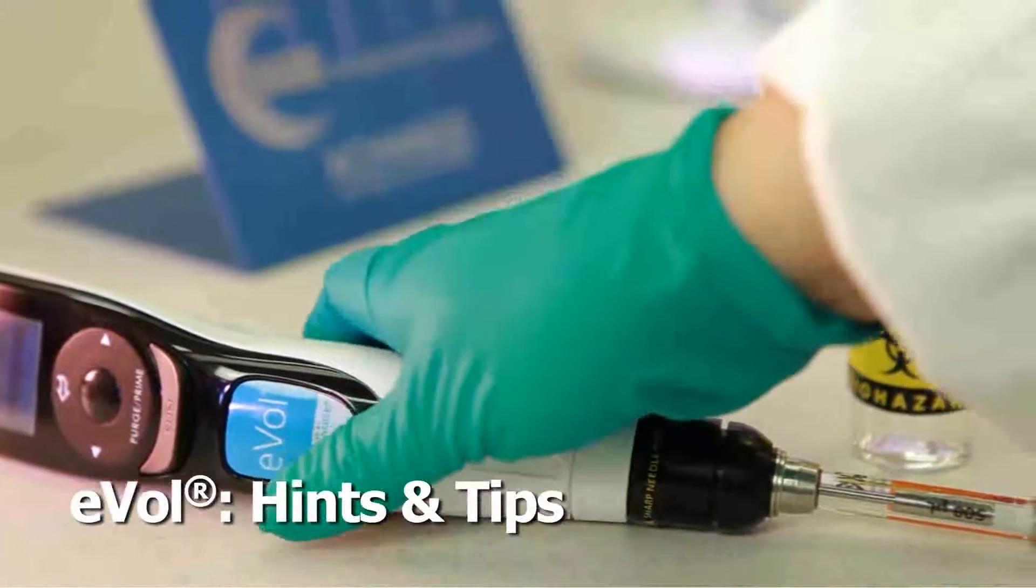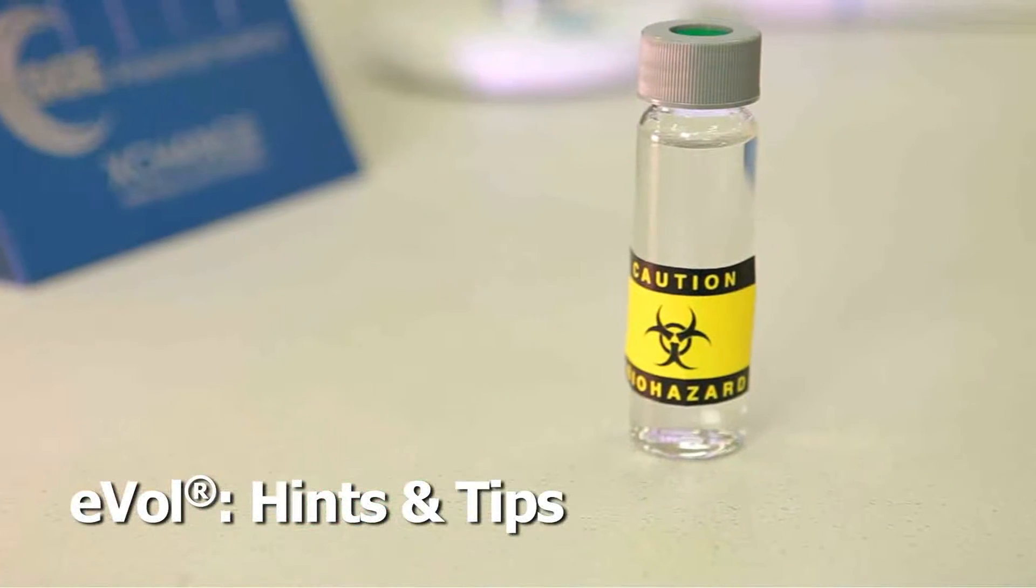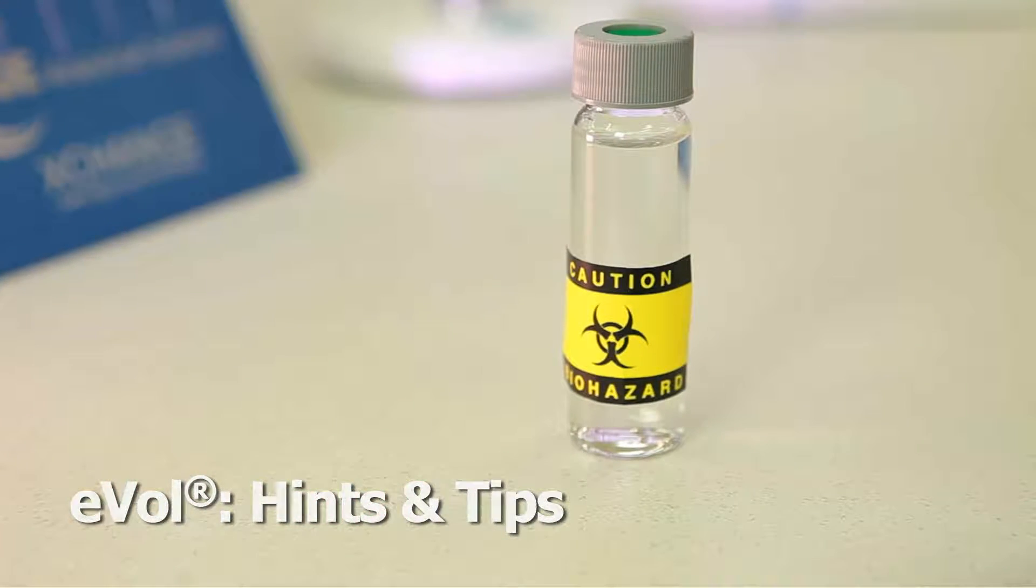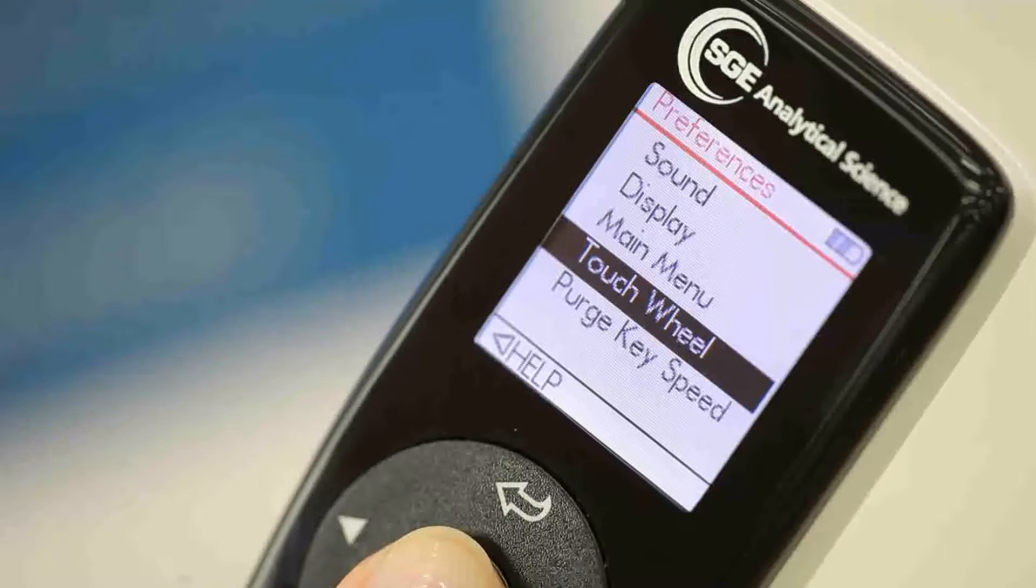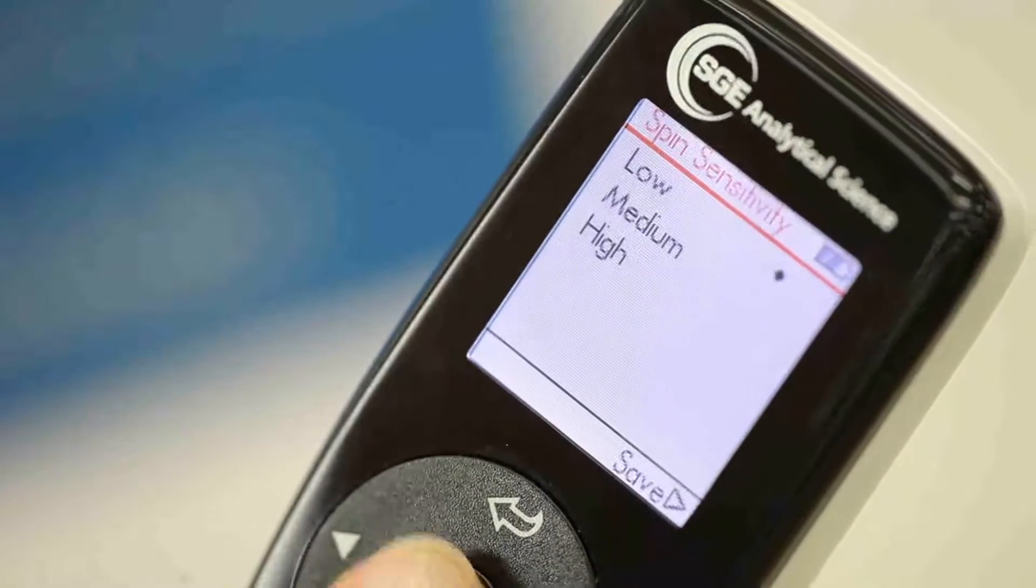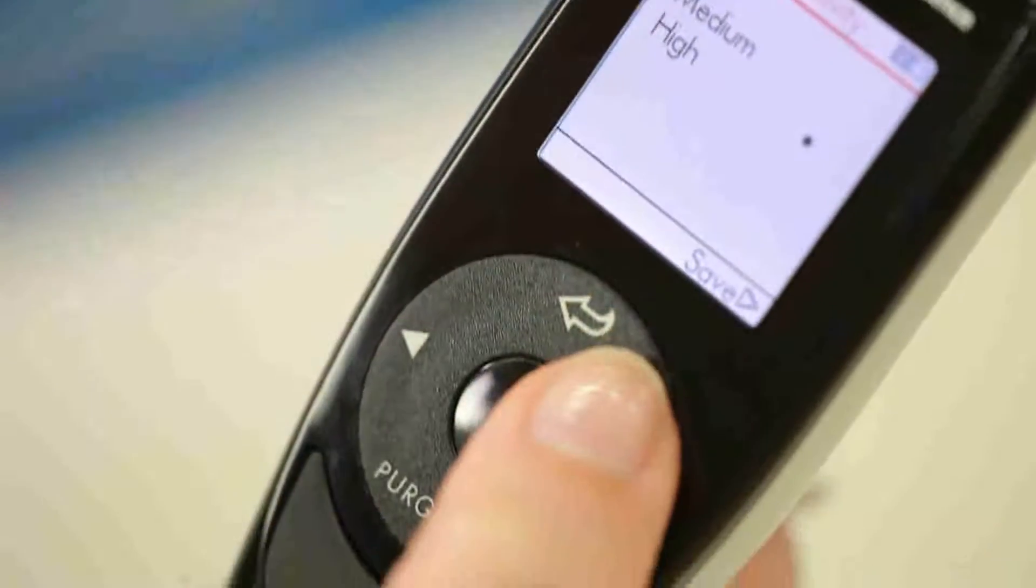EVOL can be used with any liquid, even with volatile materials such as organic solvents and hazardous liquids. When gloves are necessary, just select the toolbox option to adjust the touch wheel sensitivity.